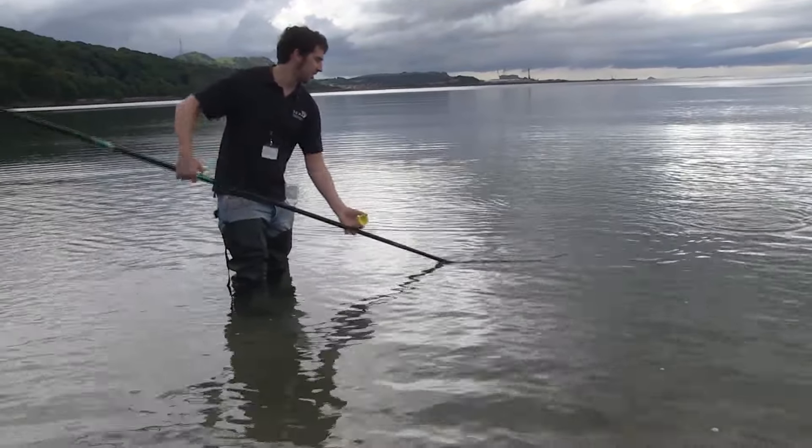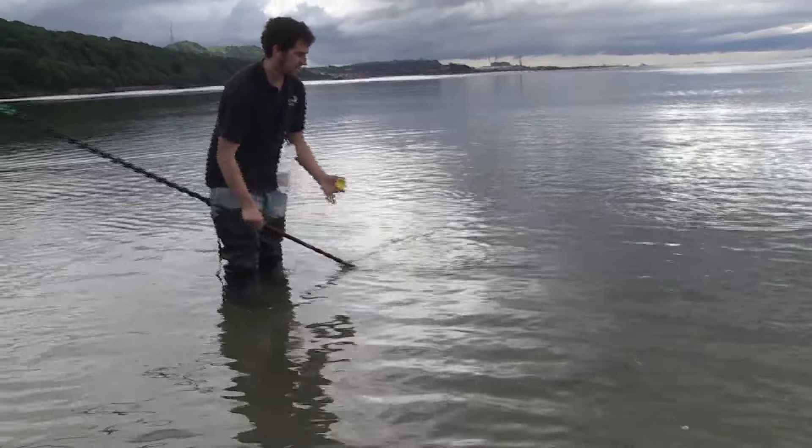Basically you just go out as far as you can with your waders. If there are waves coming in, sometimes you can't go out as far, or you're going to get wet.